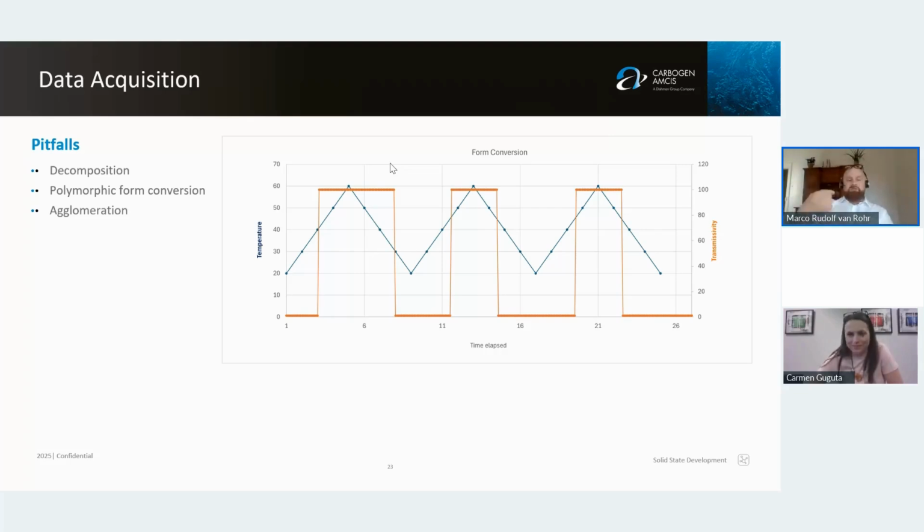So it really was going up, wanted to dissolve, reprecipitated, and then went up again. Yes, so in the transmissivity data itself, we saw such a knee. And that was our indicator for a polymorphic form. What we did when we saw this data was measure powder X-ray before and after. And we saw that we had certain reflexes going down. So we started with a mix of polymorphic forms.